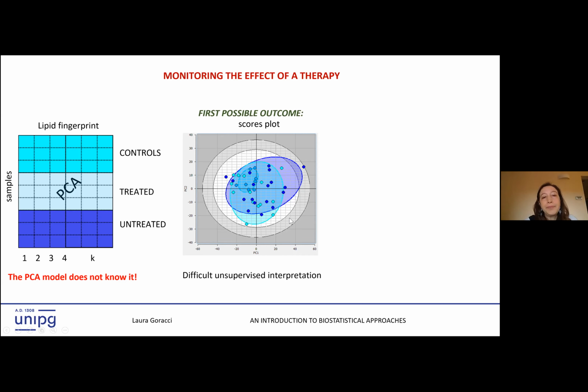One is here: the first 2 principal components are actually not able to separate anything. This doesn't mean that other components are not able to do it, but there is another variation that is stronger in your data. It could be a batch effect, or anything can happen in your data. So it can be informative anyway.